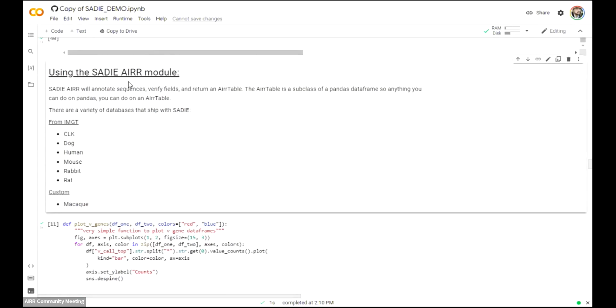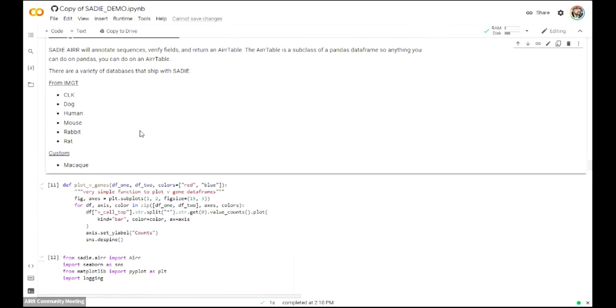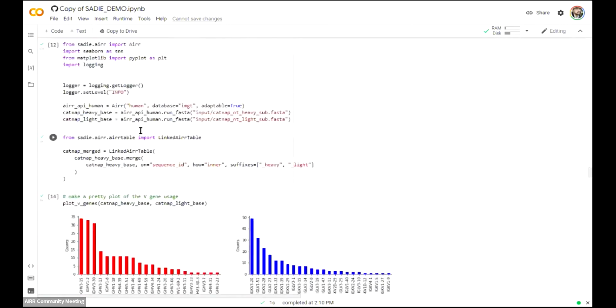And so if you're in Python and you're in data science, you definitely know what the Pandas library is. I personally love it. It's, you know, the greatest thing since bread, not just sliced bread. That is how great it is. So I use it for everything, and I want to show you a little bit about how to use it. So SADIE ships right off the bat with a couple reference libraries that are completely simple to use.